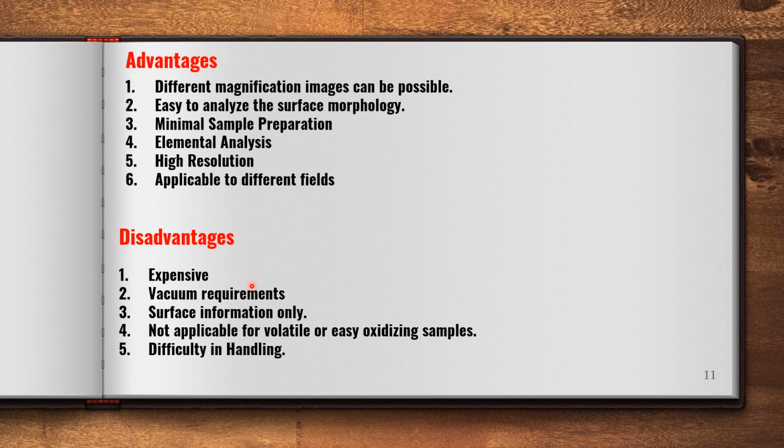Disadvantages: it is expensive, the vacuum requirement is high, it gives surface information only, it is not applicable for volatile or easily oxidizing samples, and there is difficulty in handling. So this is about the advantages and disadvantages.